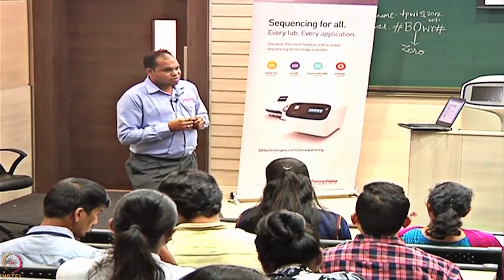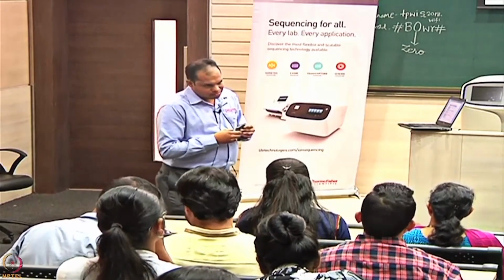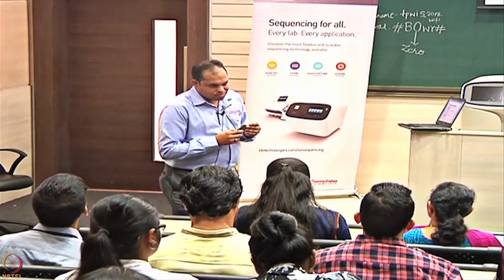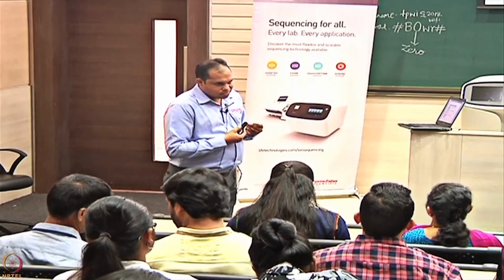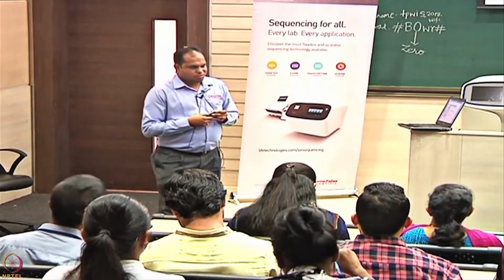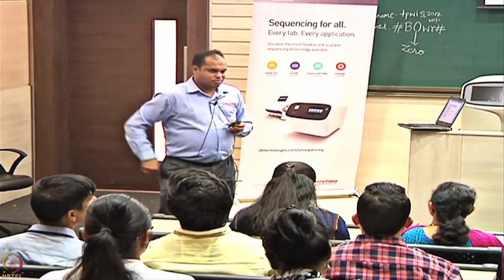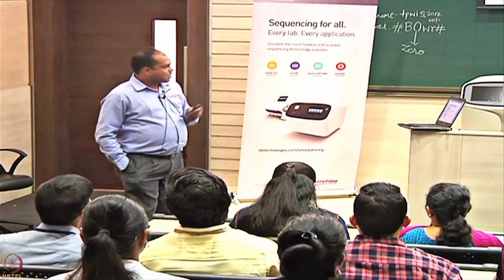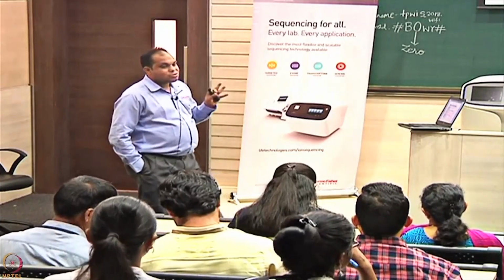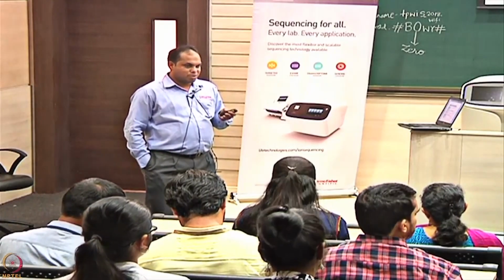My question is, have there been instances where Thermo has approached the clinicians and tried to make some changes in the WHO protocols? No idea about it. We don't have an idea about it. Okay, it's not applied in the clinics because of this reason. Actually, that's why we have brought this particular tool, this particular software, which helps you to get the information in such a way that it could be acceptable.